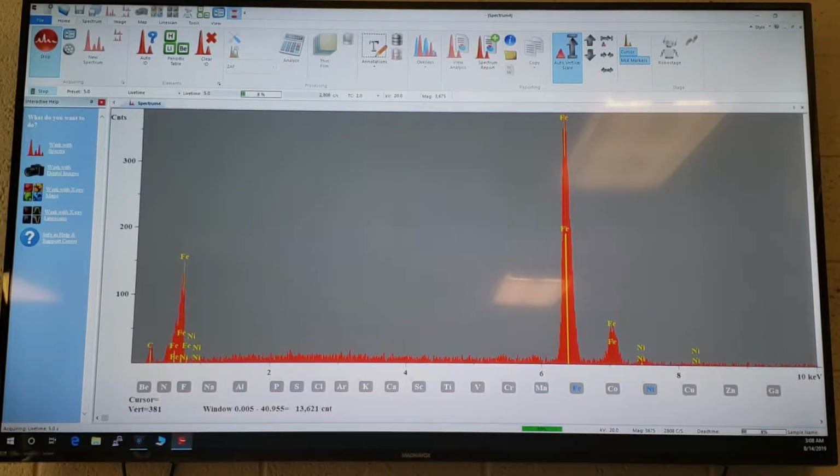If I lower this magnification, for instance, let me give you some more information. Like this is that big piece that's in there. Is that correct? This was a big piece. Yeah. That's fine. We can do that. So we found the elements that we want to look at.